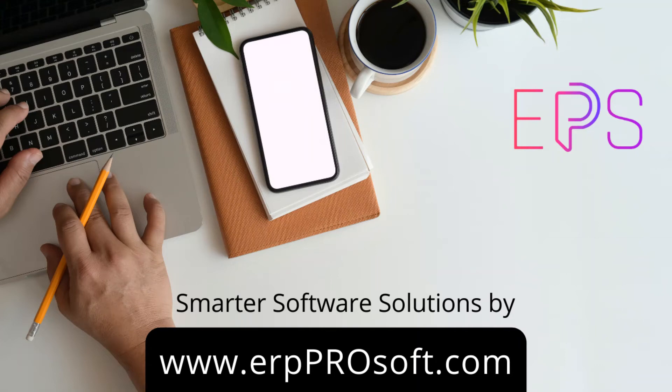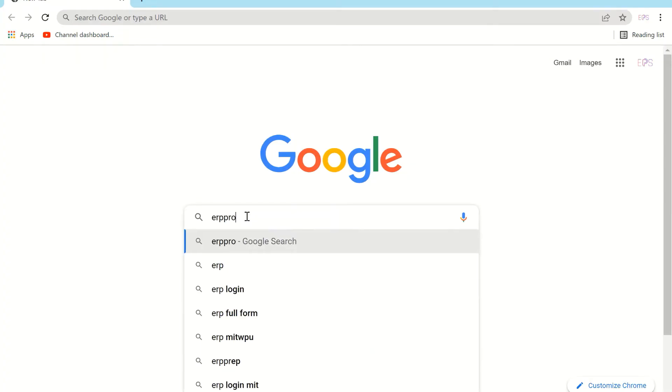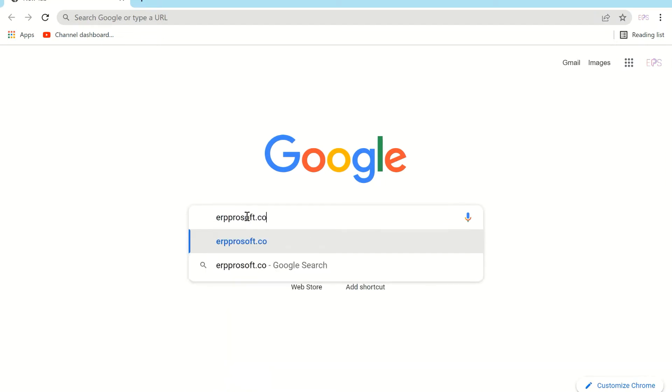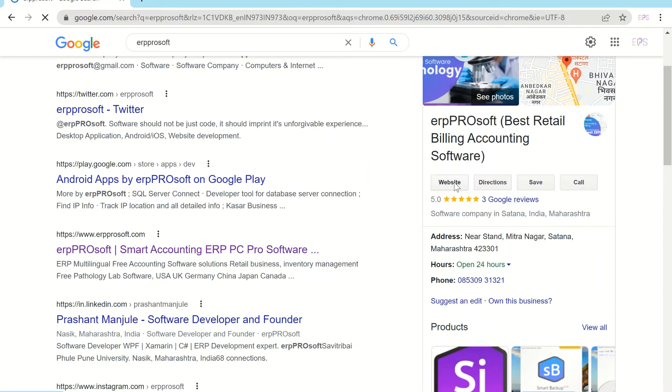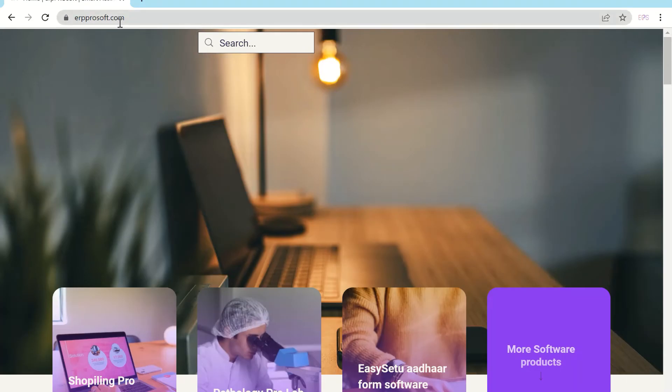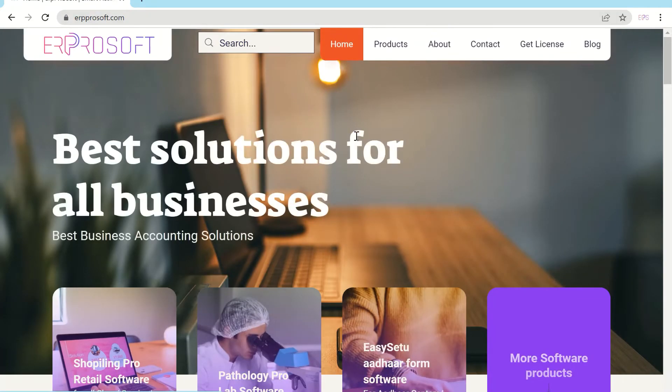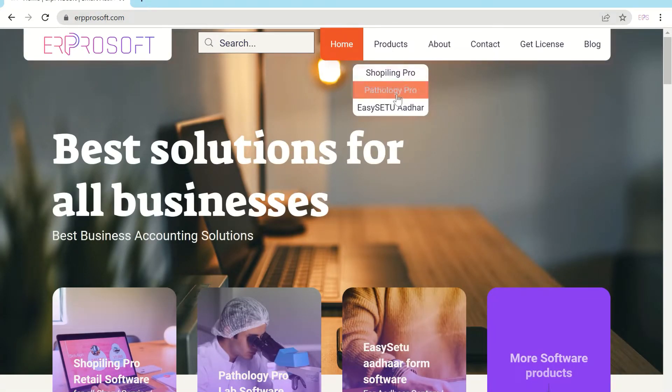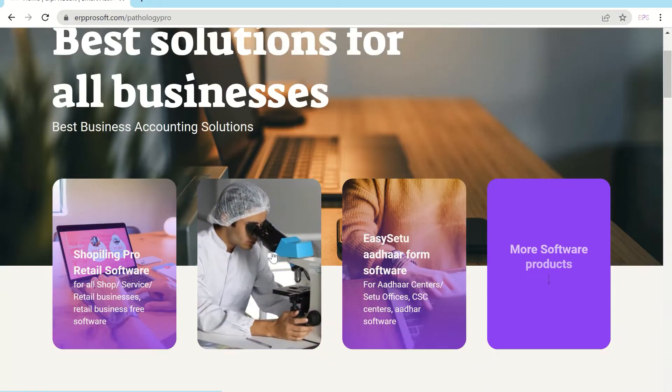Hello, to download Pathology Pro visit erpprosoft.com. In this software you can add any test in the world with smart advanced user interactive interface and features. This software also does accounting of patients or hospital accounts.